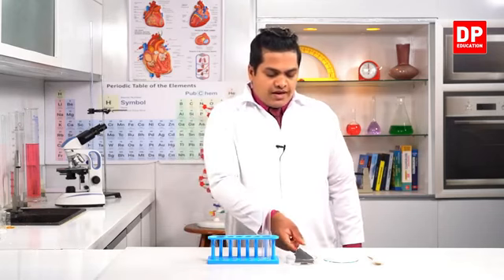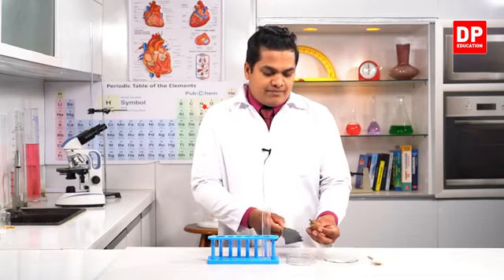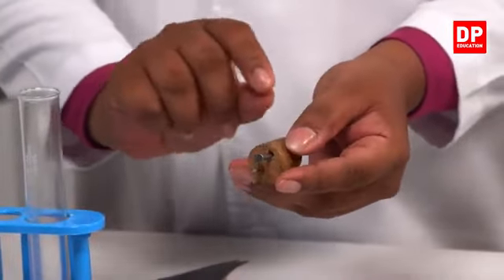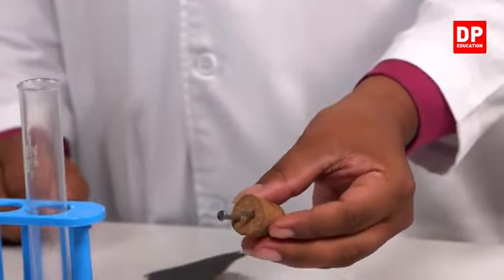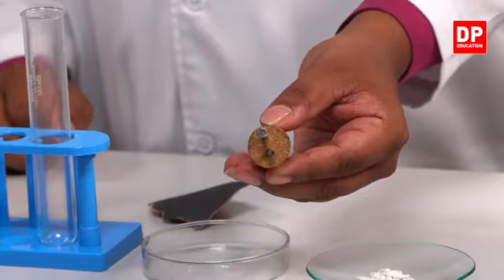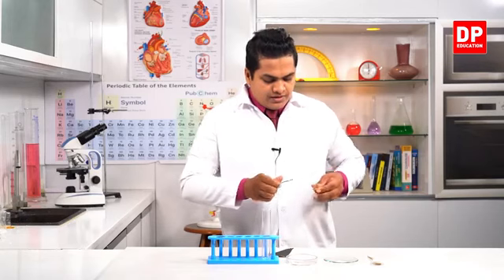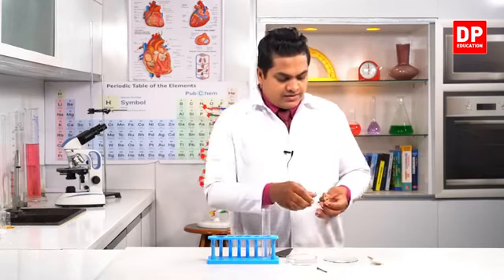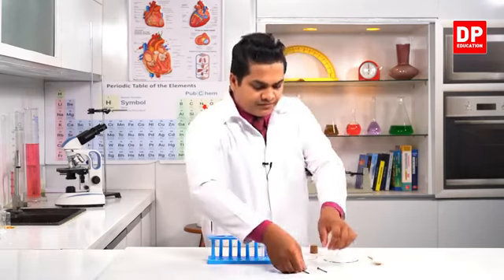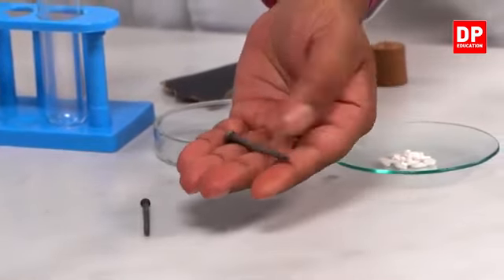So first of all, I have a cork, and by using this sandpaper, I have scrubbed the surfaces of the iron nails very well and I have cleaned them. So you can observe there is no rust in it. I'll remove the iron nail and show it to you. There is no rust in these iron nails. See, these are very clean. These iron nails are very clean.